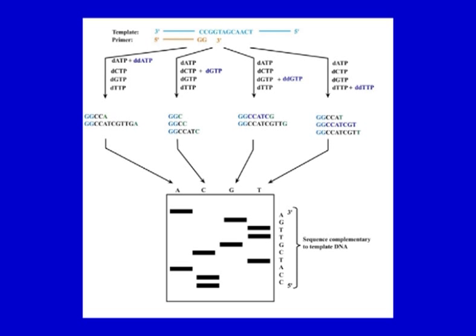So, it will be CC here, then A, then T, then CC, CG, and likewise you will get the sequence. Reading from top to bottom excluding the primer, you will be able to read the sequence from the sequencing gel on the autoradiogram.